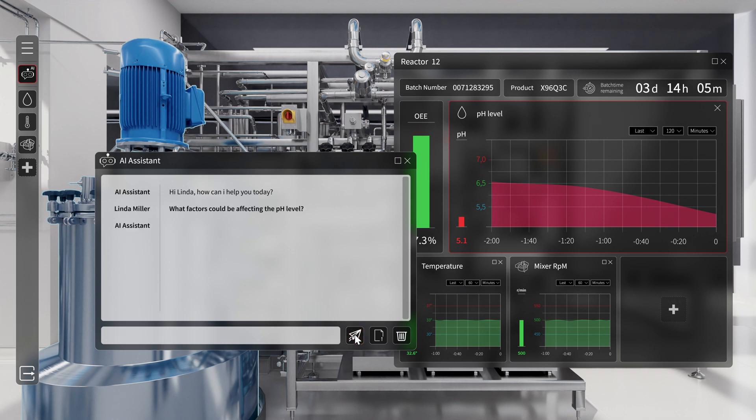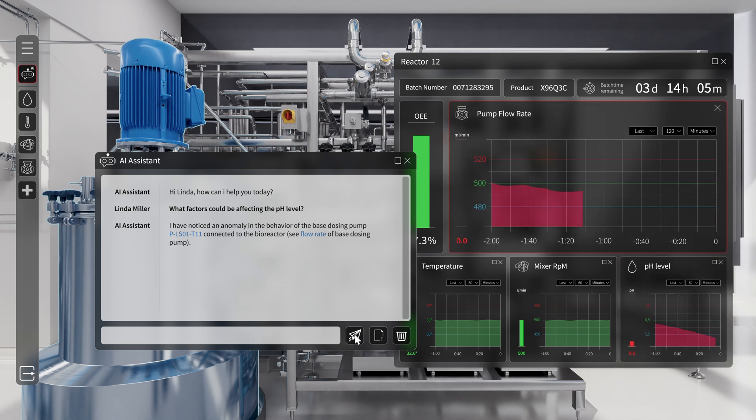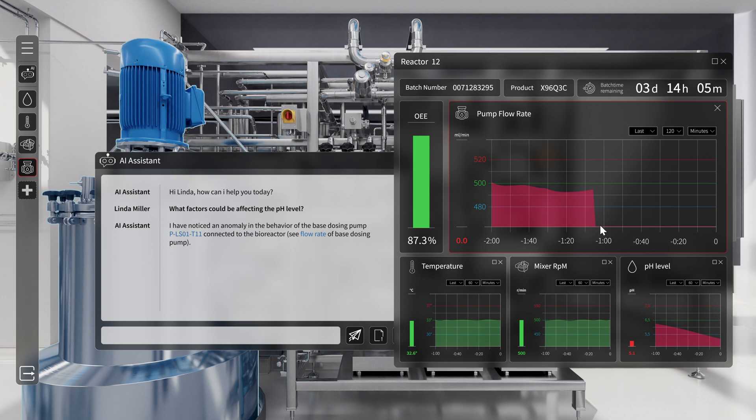The AI reacts immediately. A diagram shows the flow rate of the base dosing pump. It has dropped to zero.